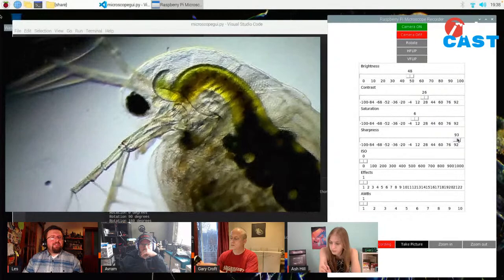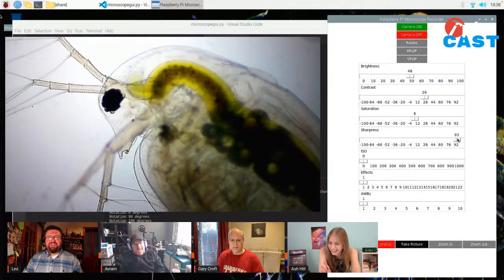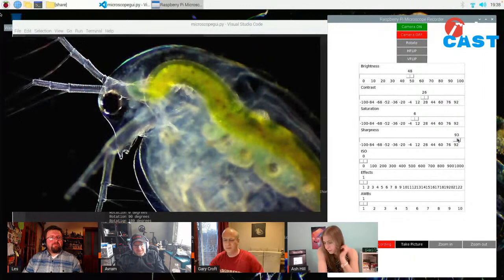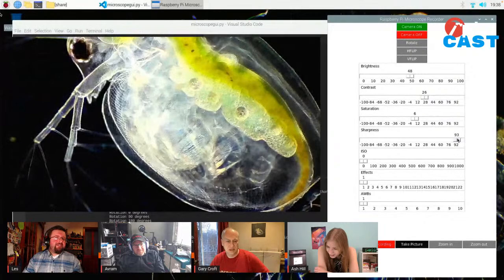I've got two microscopes. The other one's a stereoscopic one. This is the compound. I've also got 3D printed filters you can put in - if I just slide one inside and then open up the diaphragm, you start to get real sci-fi views. It's called Darkfield. That green tract is its digestive system - it's full of algae.